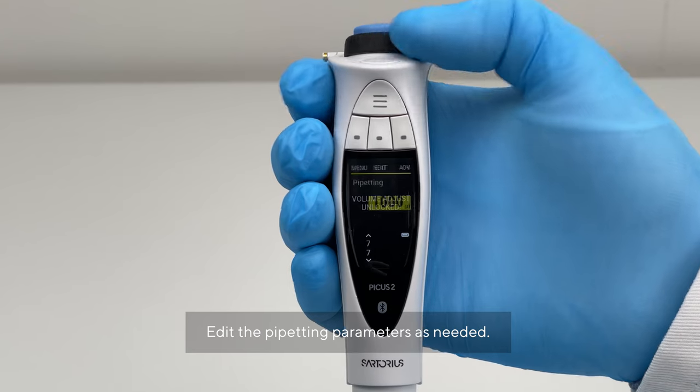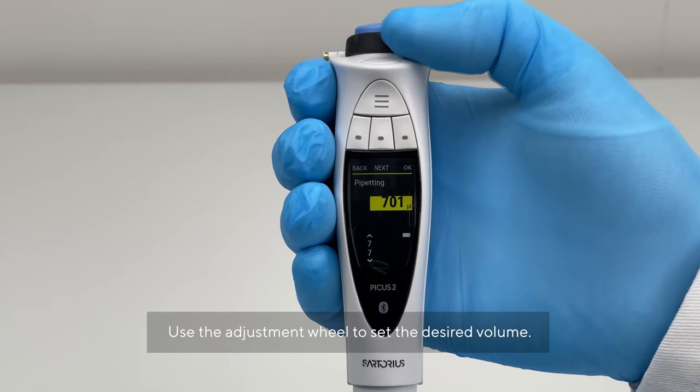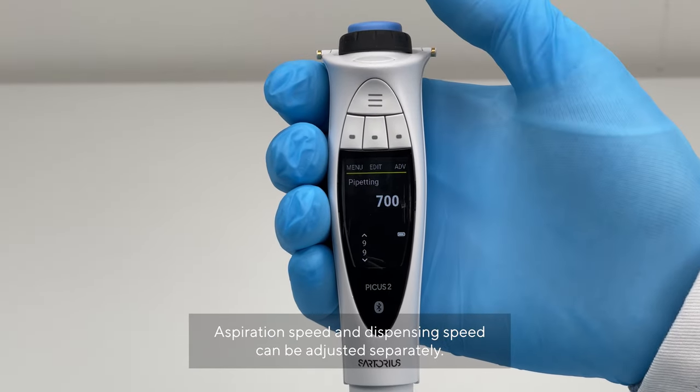Edit pipetting parameters as needed. Use the adjustment wheel to set the desired volume. Aspiration speed and dispensing speed can be adjusted separately.